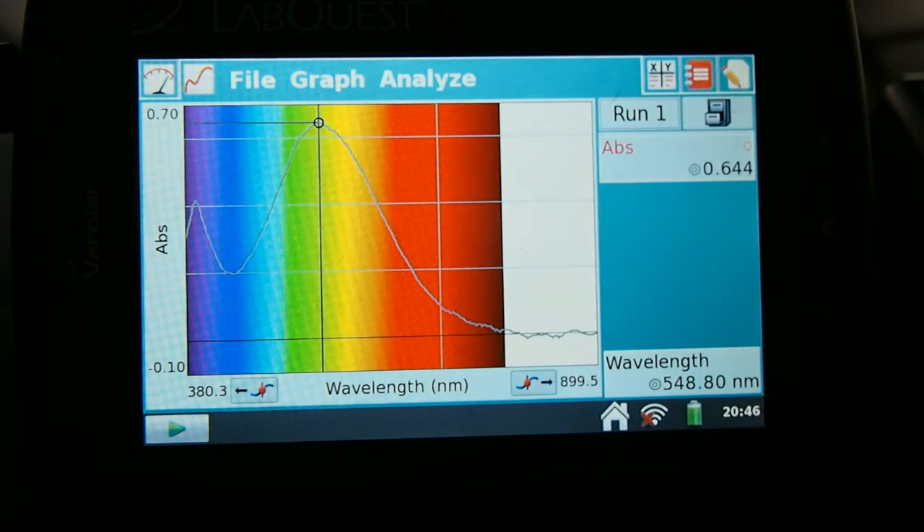And you can see that it will find the peak absorbance. In this case, it's in the green range, or about 549 nanometers.